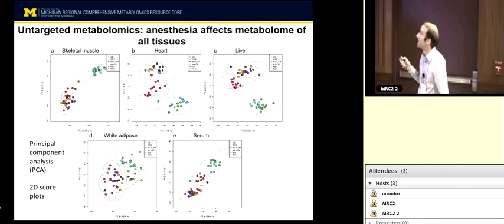The tissue extraction procedure, just to go through it in a little bit of specificity for this study. As I mentioned, we cryopulverized the tissue. We transferred a defined mass to the tubes. Something on the order of 30 milligrams is what we use when we have as much as we could want. We can definitely go to somewhat smaller quantities when needed. There gets to be a point where it's just challenging to get everything normalized, no matter what approach you apply, when you go too small.